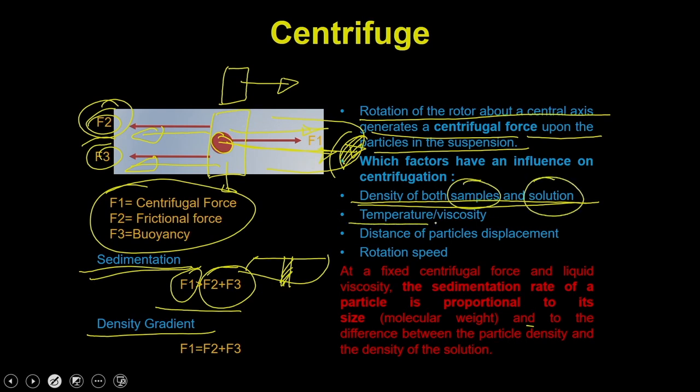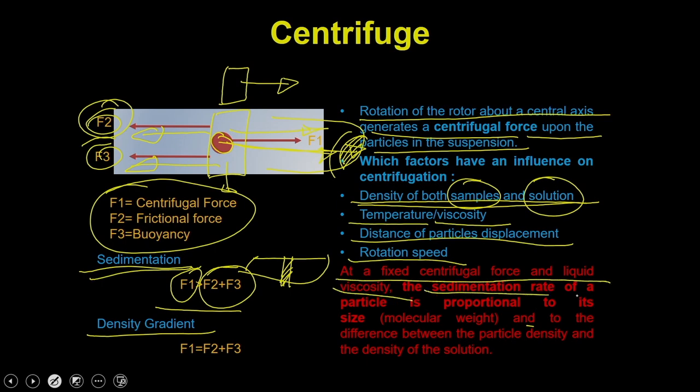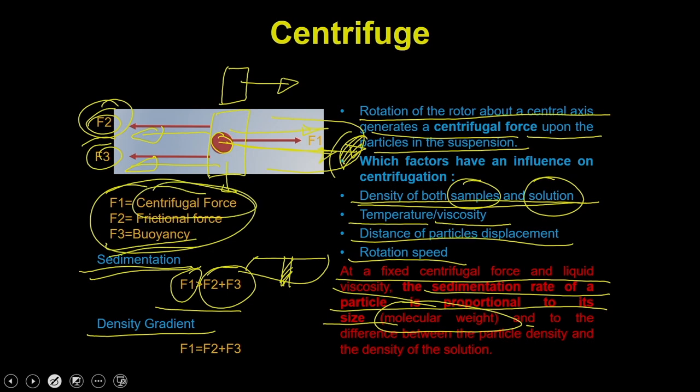Then you have the temperature or the viscosity, then the distance of the particle displaced, as well as the rotation speed. At a fixed centrifugal force and liquid viscosity, the sedimentation rate of a particle is proportional to its size, which means if you are considering the buoyancy identical, then the centrifugal force is going to pellet down this particular material, and the sedimentation rate is going to be proportional to the size of that particular particle and to the difference between the particle density as well as the density of the solutions.